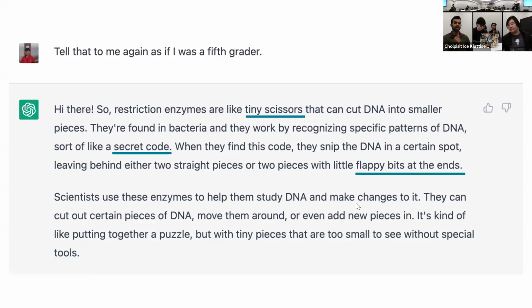For restriction enzymes, this is a very cheap and cost-effective way of determining whether you have a correct cut, for example, a cut in the general area that you expect. I'll show you how to do it in Benchling, an online software, so you can predict exactly where this should cut based on what it recognizes as your restriction site. Then you want to quickly check whether it's the correct area, the correct sizes. Let's say you cut a 3000 base pair fragment at two-thirds, you get one that's 2000 and one that's 1000. You should still see two bands, at 2000 and at 1000. So it's a very easy way to determine whether it cut at the right place.